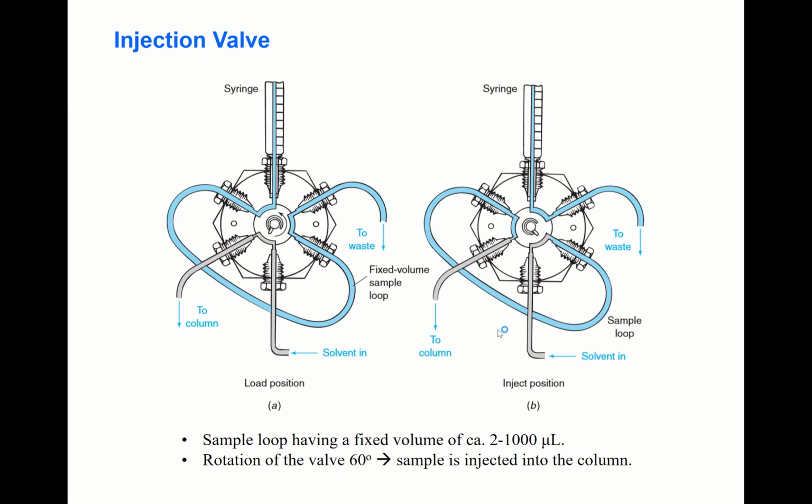Since you still keep flowing this solvent, your sample is now confined within this tubing, this amount.